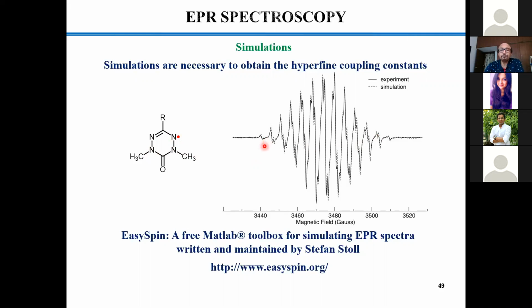Okay. Sir, in this only, if we take the Q band, will the CH3 protons also split the signal? No, that's why I already mentioned that only one data set is available in the literature, that is the X band data. So for Q band and W band, what will happen, we don't know. Now at Q band, most unlikely this proton will come into the picture. I am anticipating that this nitrogen might be exposed, because this proton is far away.